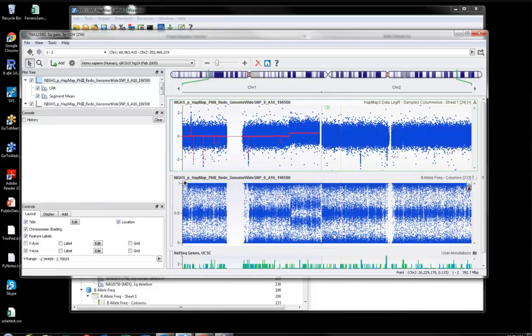As long as you have this consistent pattern of 3 bands, it's telling you probably have 2 copies overall. When you see a pattern where you have 1, 2, 3, 4 bands, that's usually consistent with having 3 copies of the genome, because you have the AAA genotypes down at the bottom, BBB genotypes at the top, but then you have the 2 unbalanced heterozygotes in the middle, AAB and ABB, and that's why you see that variable banding pattern.